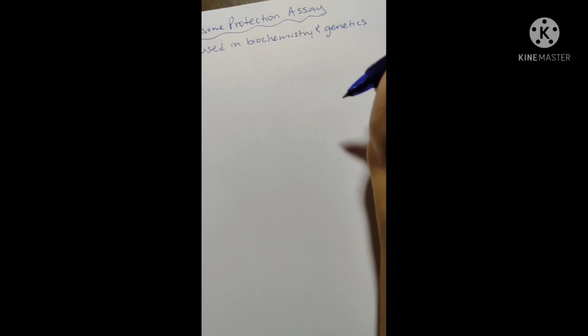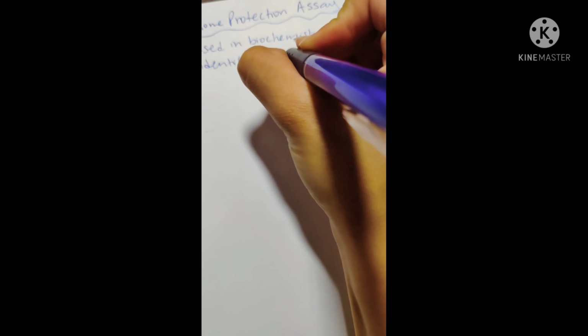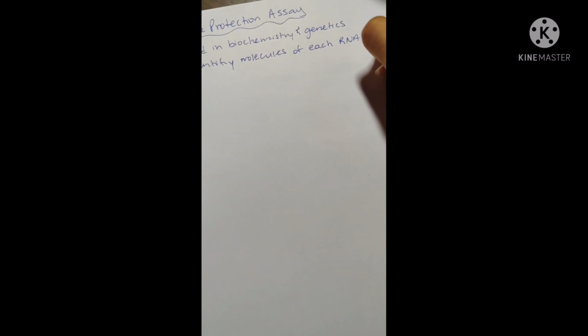In order to identify molecules of RNA that are present in different RNA samples.